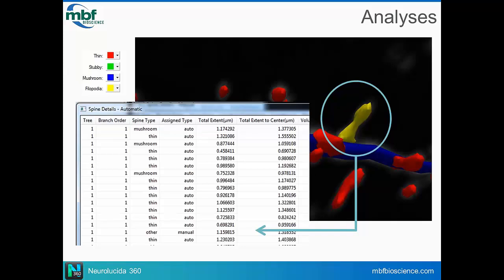You should really go based on specific spine sizes that have been already established through EM quantification and for specific brain regions and for specific species, because otherwise you can just randomly take out of a hat and, you know, bias your data, which could be true or not true. So I think that is something that really has to be considered.